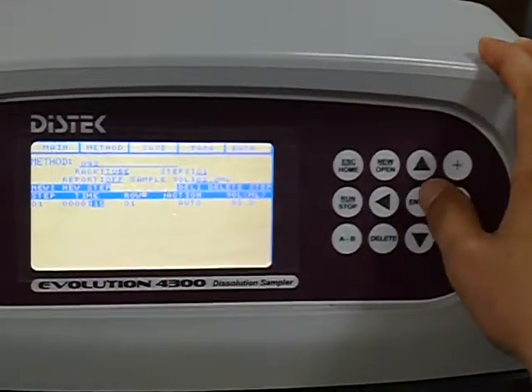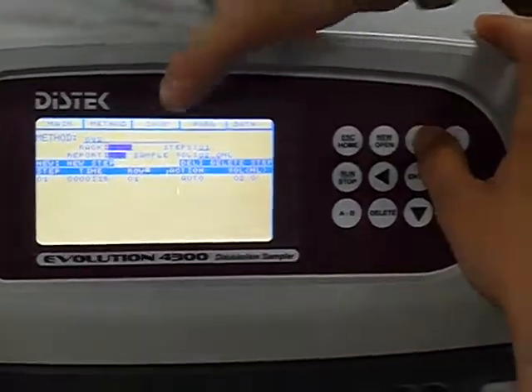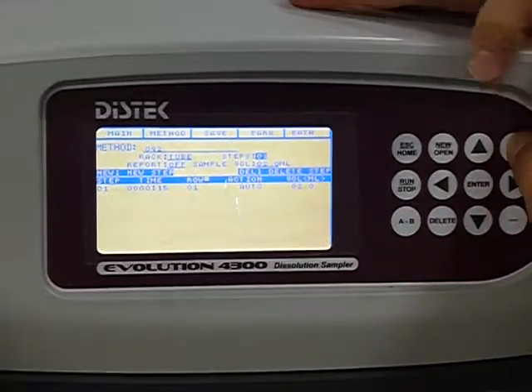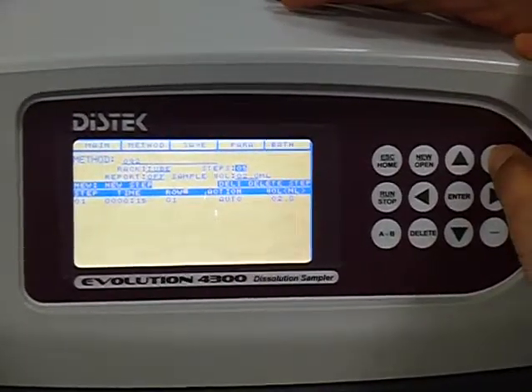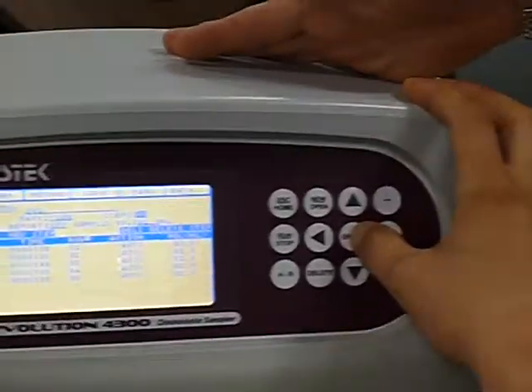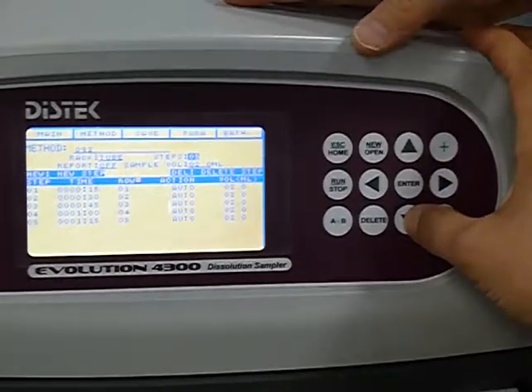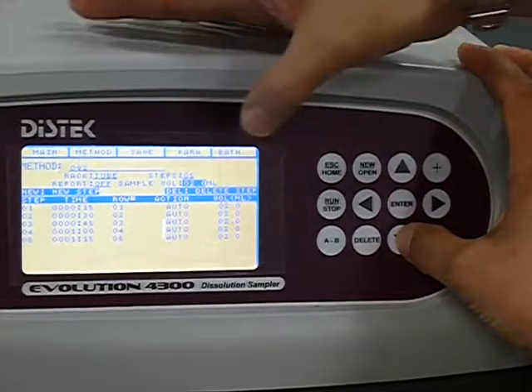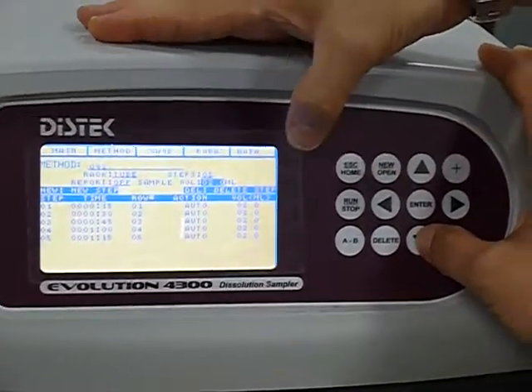Where do I set in the steps? Steps. Then you go across. Enter. Oh, now that you're in there, use the plus and minus arrows, up and down, to give you how many steps. 5, enter. Now, it probably doesn't say anything for volume because that is if you happen to want to make things easier.